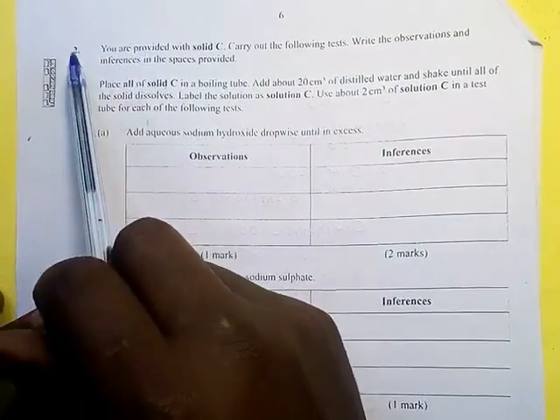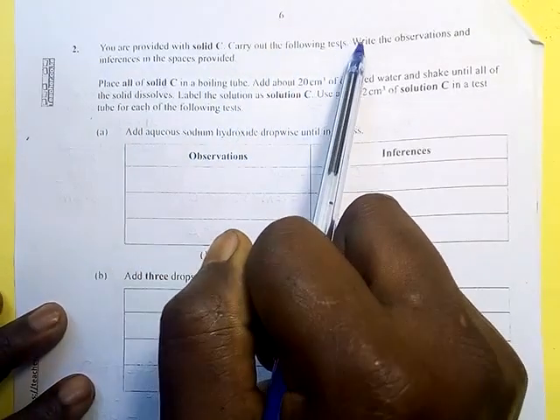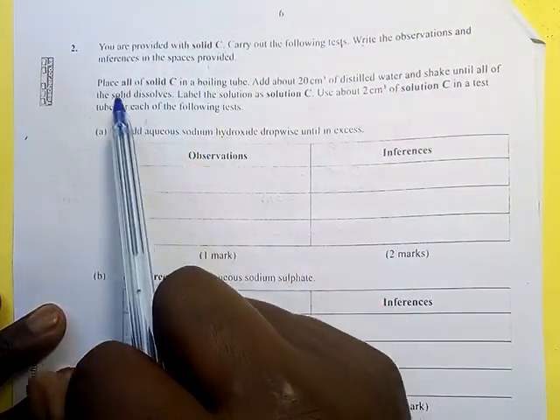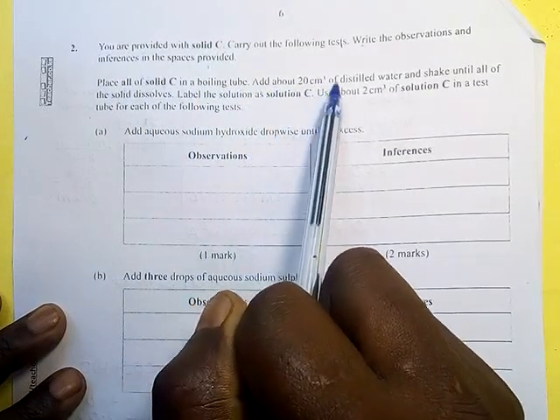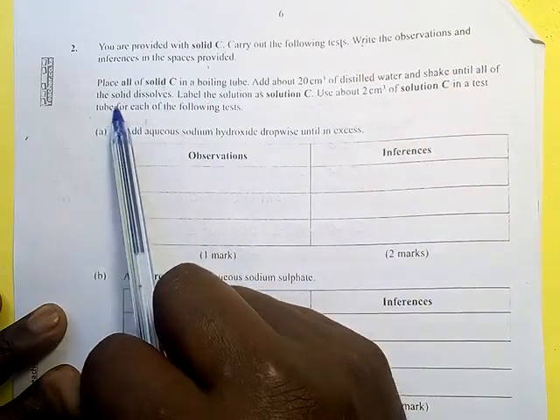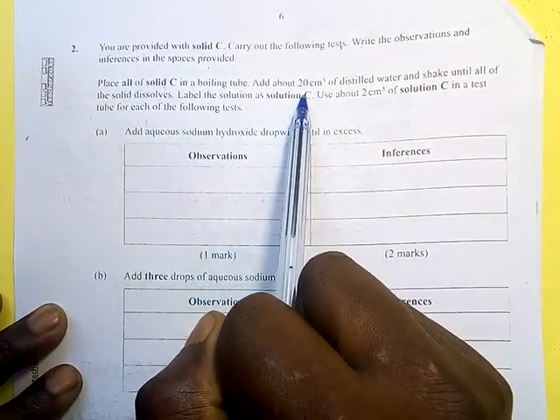You are provided, that's question 2, you are provided with solid C. Carry out the following test. Write the observations and inferences in the spaces provided. Place all solid C in a boiling tube. Add about 20 centimeters cube of distilled water and shake until all the solid dissolves. Label the solution as solution C.